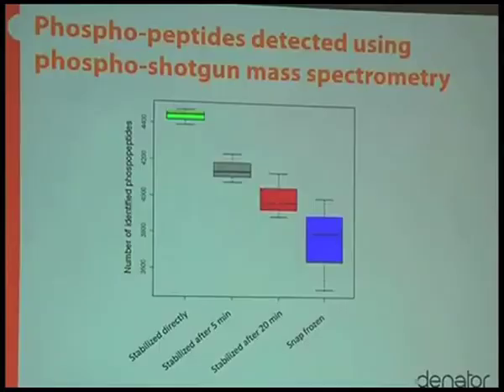Since it's sort of impossible to know how many phosphorylations are there in the tissue originally, a tool that we generally use is time course studies. By following what happens in the time course post-sampling, you get an idea of how your molecules of interest change. So on average, the majority seem to be that there's a loss of phosphorylations.